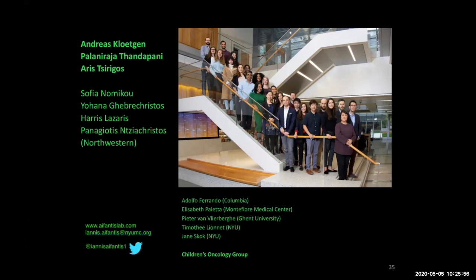We have filtered out any of this kind of translocations. We were lucky that T-ALL, pediatric T-ALL, is not particularly unstable as a disease. So it was relatively easy for us to basically filter out these few translocations that existed in each sample and make sure that whatever we define as interactions are not affected by this kind of chromosomal events. But I absolutely agree. There are tumors, both leukemias and specifically solid tumors, that people have to be very careful with their analysis.